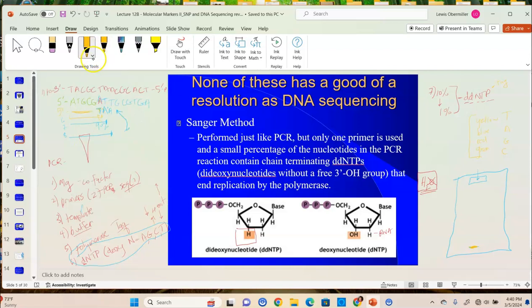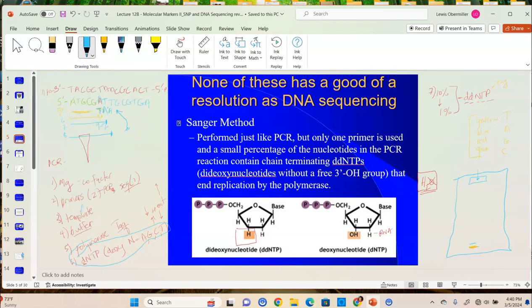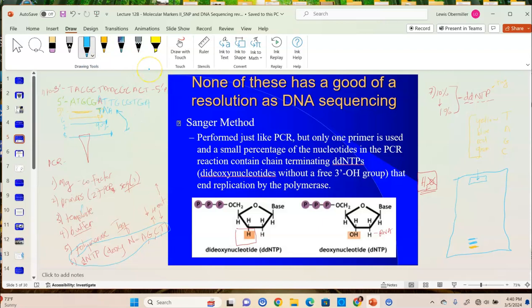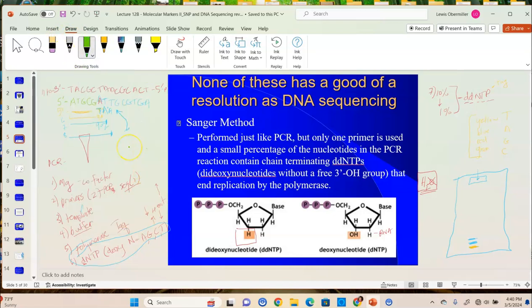And then the next fragment is going to be blue because it's an A. Right? This one is one nucleotide longer. The next one is going to be blue because it's an A. The next nucleotide in here, so AA will be a C. What color is C? We made C green. So this C right here is going to be green. So that's going to be 9 nucleotides. So that's going to be here.